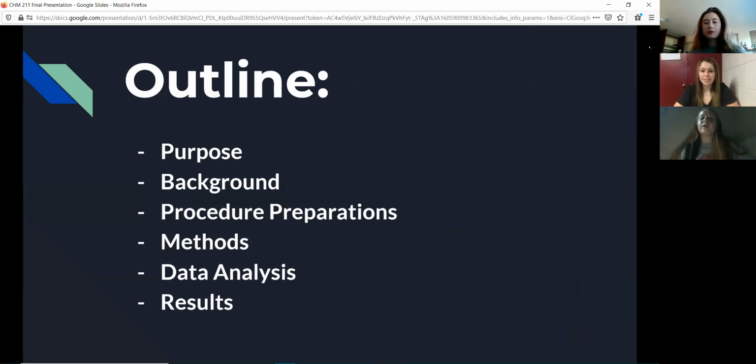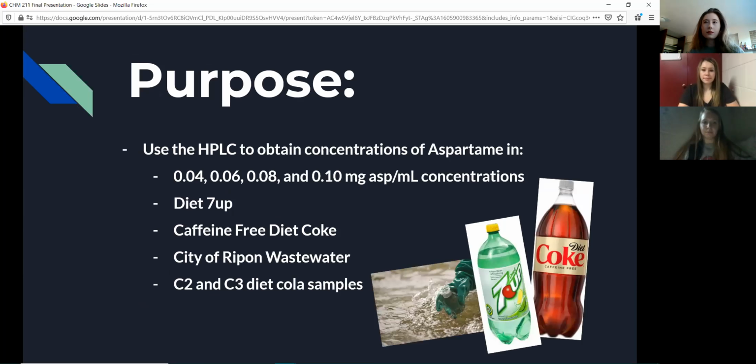My group and I will utilize this presentation in order to explain the purpose, background research, procedure preparations, methods, data analysis, and results for our lab project. The purpose of our project was to utilize the HPLC instrument in order to obtain concentrations of aspartame.